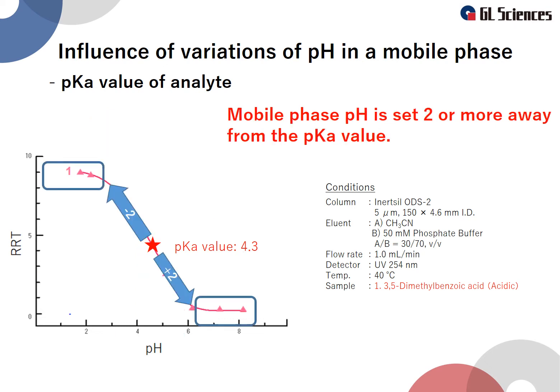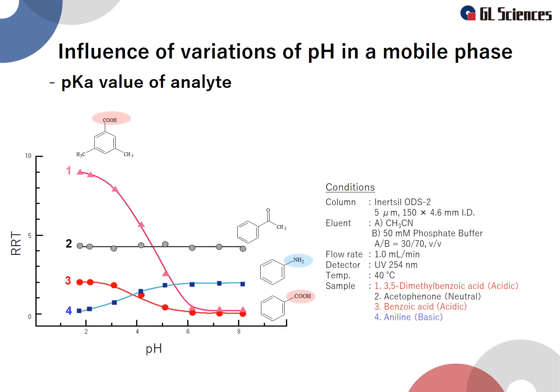We recommend setting the pH of the mobile phase to be 2 or more above or below the pKa value of the analyte. In this range, it does not significantly affect the retention time even when the mobile phase pH slightly changes. The fluctuation range of retention time with pH values differs between analytes. As shown here, neutral compounds do not fluctuate regardless of pH.